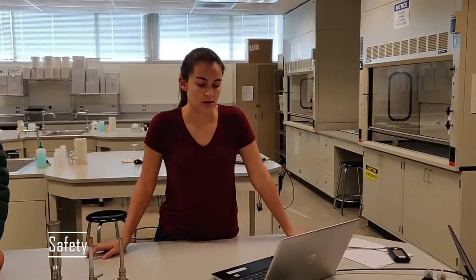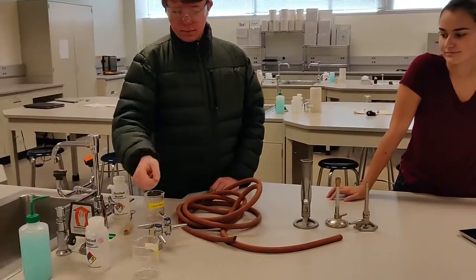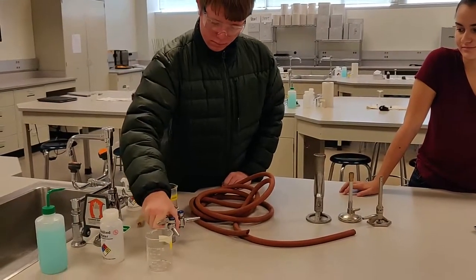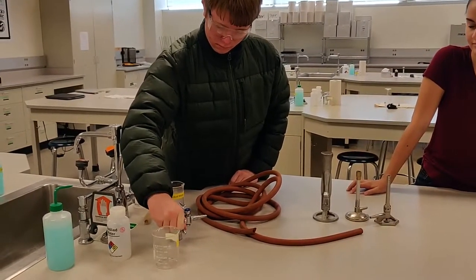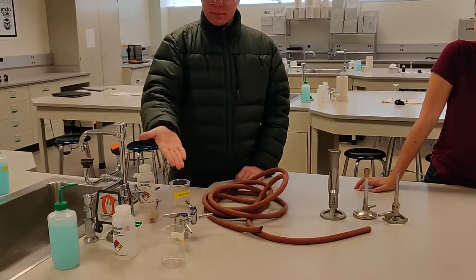There are lots of dangers when working with flames while using a Bunsen burner. Be aware of how to turn the gas nozzle on and off, just in case of emergency. In the case of a gas leakage, make sure you know where your emergency gas shutoff valve is.